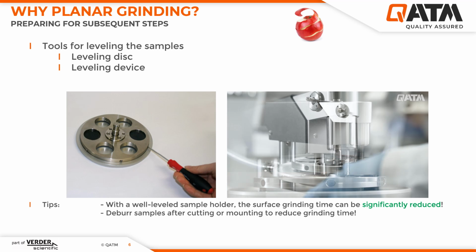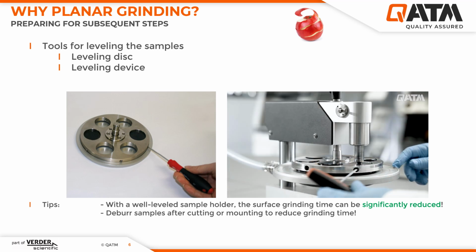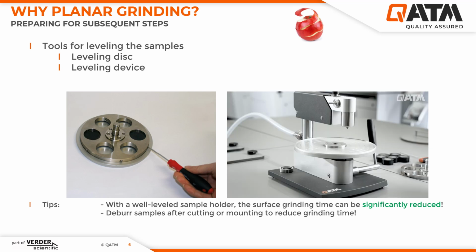At this point, I would like to point out two things. First, I would like to underline that with a well-leveled sample holder, the grinding time can be significantly reduced. Second, I would like to recommend that by carefully deburring the samples after cutting or even after mounting, the samples can be leveled much better and the grinding time can also be shortened.